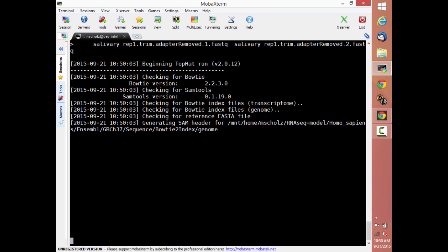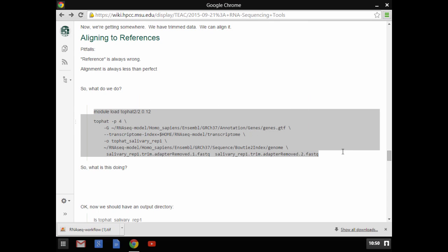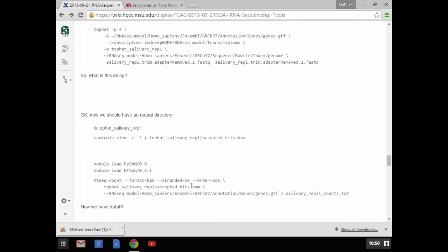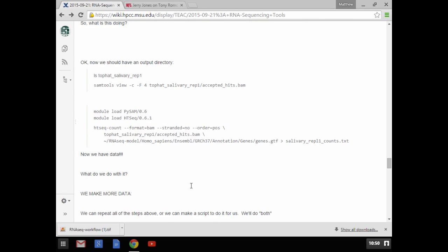Right? We're taking a 100th or a 500th or a 1,000th of the actual data set for this to run. So this is going to take a while. We're going to let it sit up there while I talk about other things. Okay. So the next steps require that that step finishes, which means that it's a really good time for you to ask me questions.